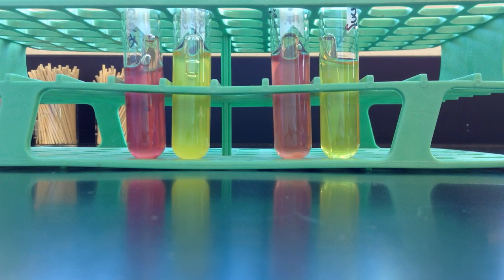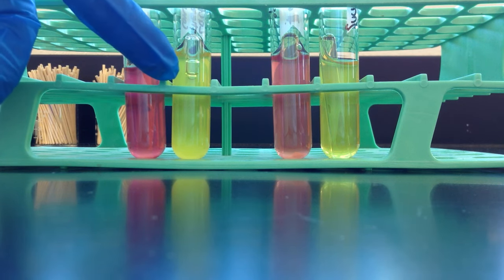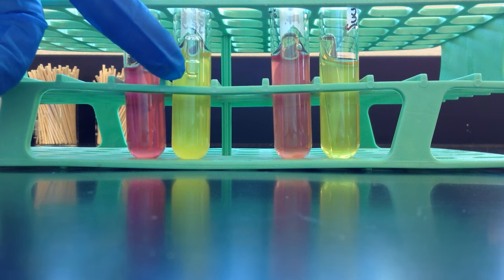So here on my lactose tubes on the left, I've got yellow, which indicates acid is produced. The phenol red turned yellow.